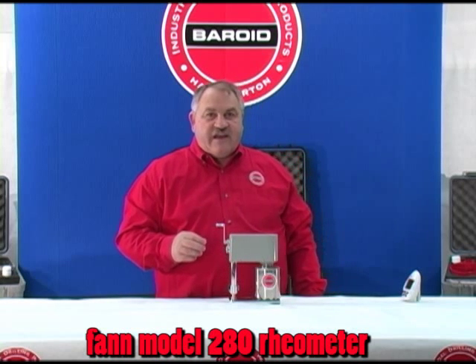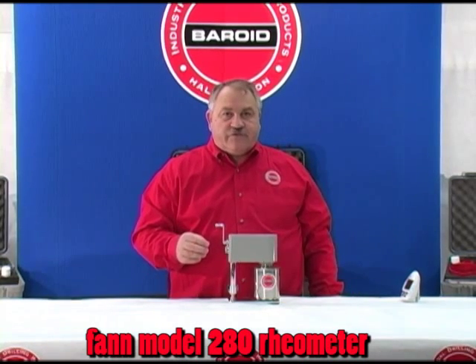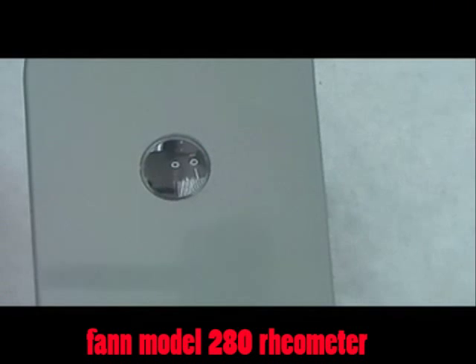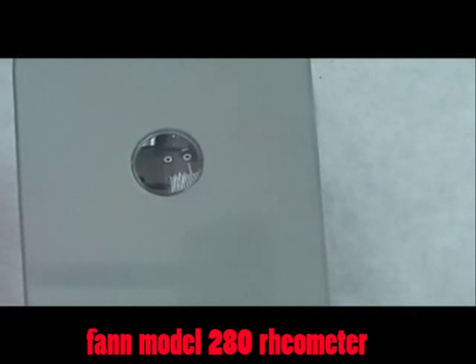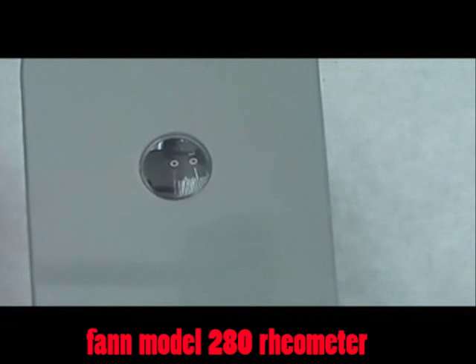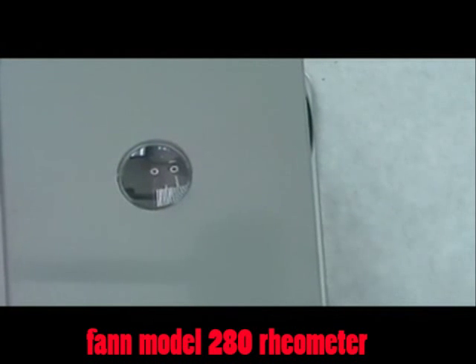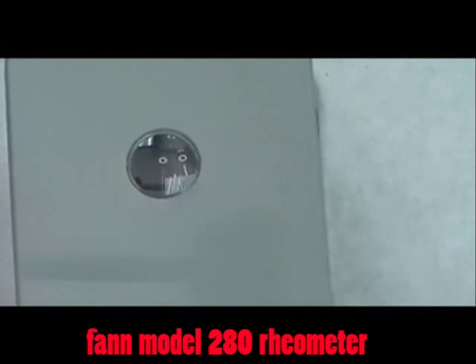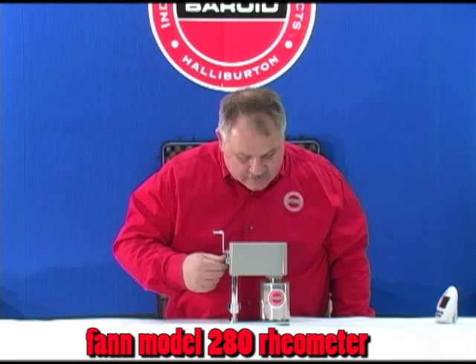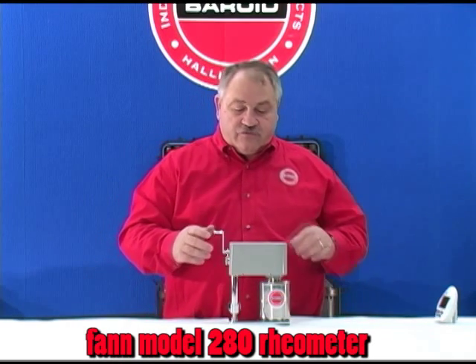We're going to wait 10 seconds to measure our initial gel strength. After counting to 10, we rotate the knurled knob at approximately 3 rpm and read the dial deflection. We get a dial deflection of 2 for our initial gel.